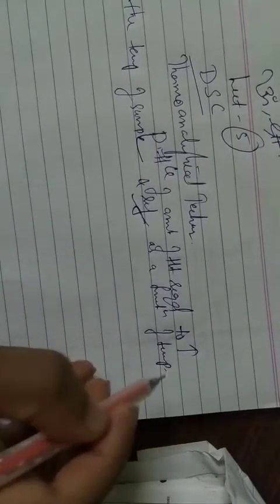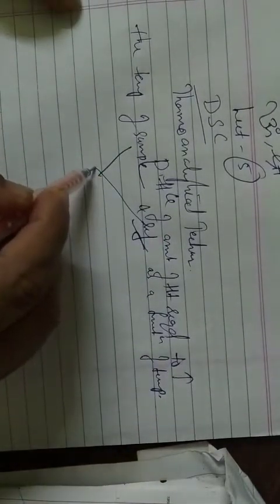Both the sample and the reference are maintained at nearly the same temperature throughout the experiment.